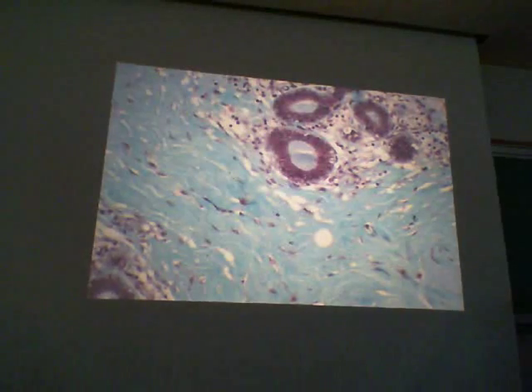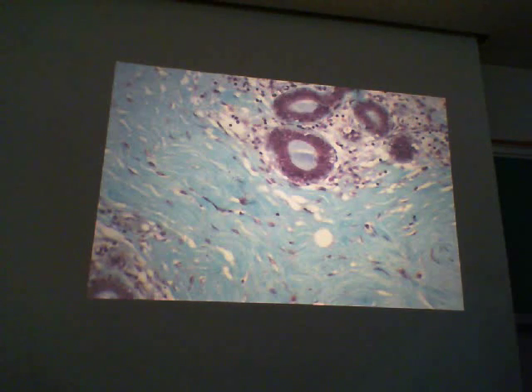Fibroblasts. And how about that cell? Mast cell. There's another one. And what may be contained in those granules? Yeah, all of those. And this tissue is what? Dense irregular connective tissue. Okay, and this tissue right here? Loose connective tissue, and that would be dense irregular connective tissue.